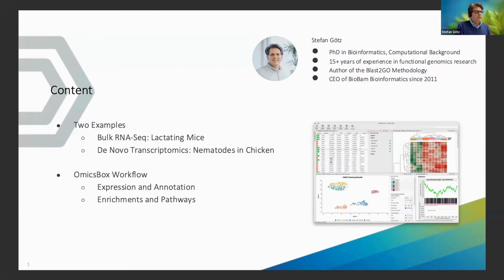So today's content will be about transcriptomics and functional data analysis. So it will be expression analysis and functional annotation of non-model organisms data. And this is the basis for what the actual title is, which is comprehensive pathway analysis and pathway enrichment analysis. So we will cover those two topics as well.